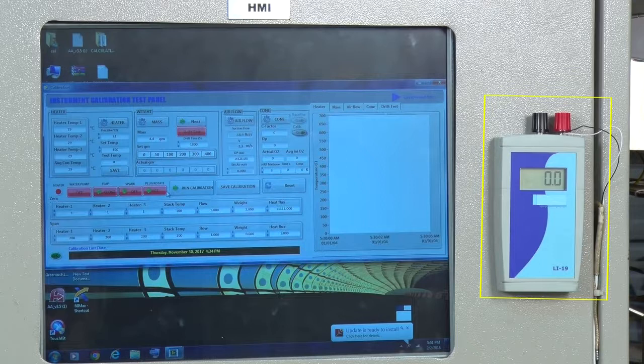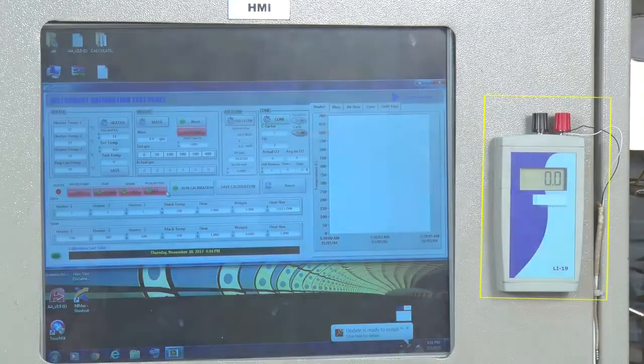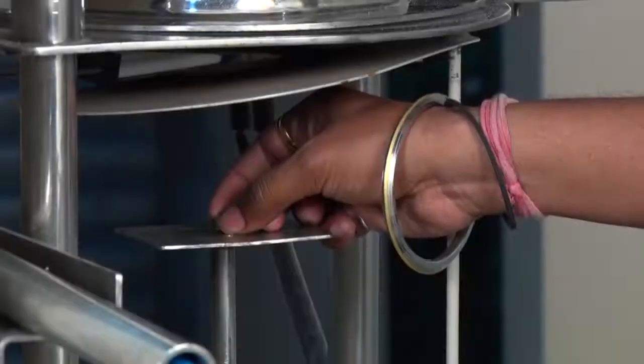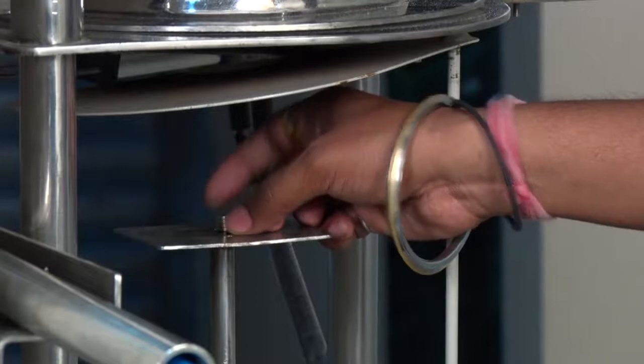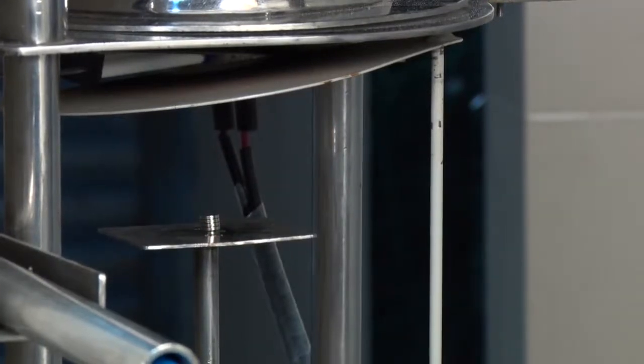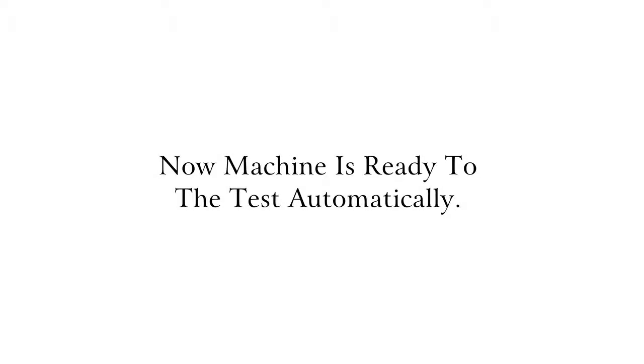As soon as it reaches the 24 KW reading, we note the temperature and set it as the heater cutoff. We also have a load cell here, along with a standard weight used for load cell calibration. We can place the standard weights on it to calibrate through the software. Now the machine is ready to check the sample.